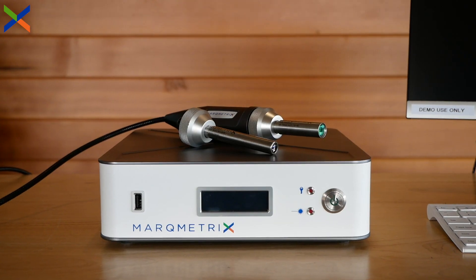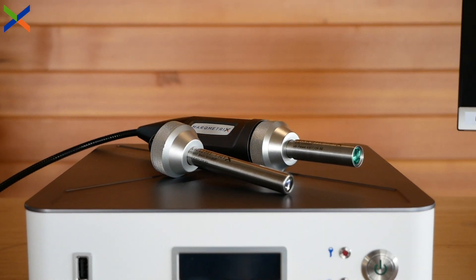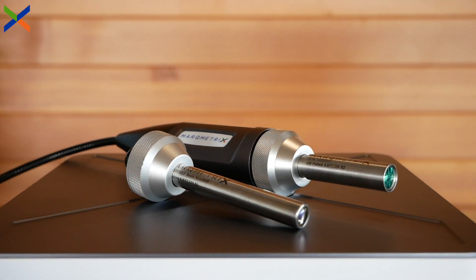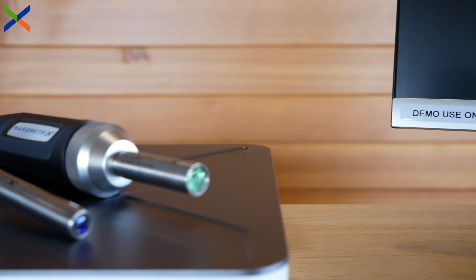This new line features two probes: Proximal Ball Probe and Proximal Ball Probe HV for high-volume sampling. These models are differentiated by their working distance — 8mm and 100mm, respectively. Both excel in measuring without being in contact with the sample, however their individual applications vary slightly.